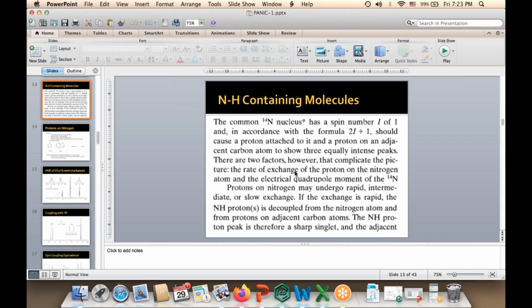Radio frequency pulse in megahertz, I don't know what the question means, but I would like to say that the NMRs we generally do are 300 megahertz or 400 megahertz. If you are talking about the coupling constant that needs to be calculated, yes, that can be calculated by taking the difference between the peak positions multiplied by the frequency of the NMR spectrophotometer.